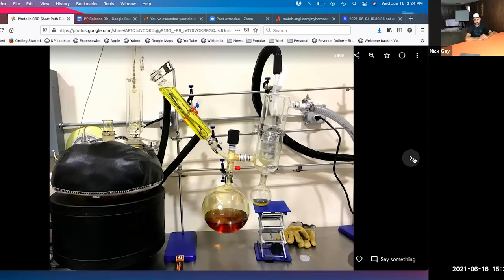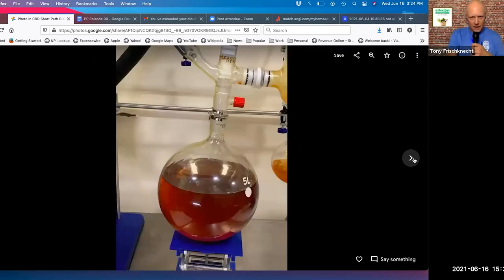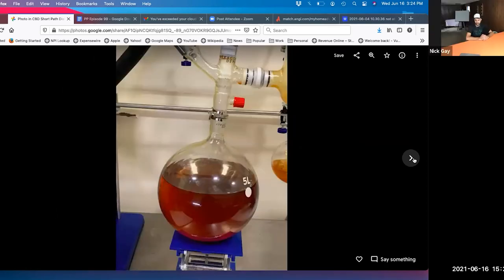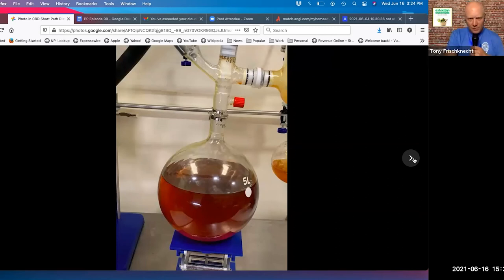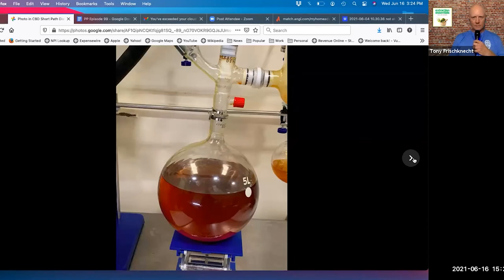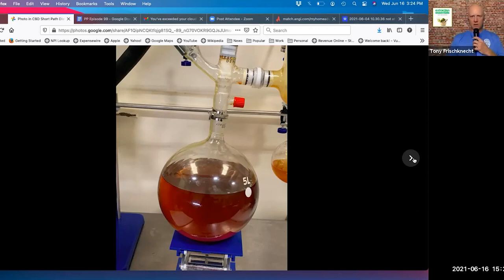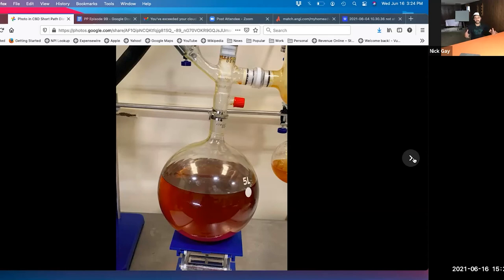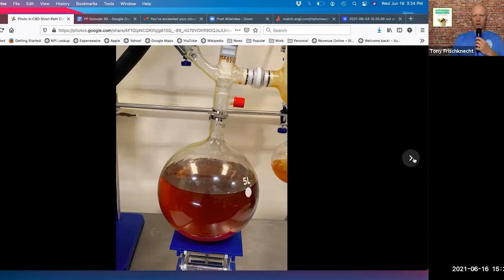My background was growing up as a carpenter. You don't need to sand a two by four that you're building a house with down with nice fine sandpaper if you're going to be hiding it in a wall. It doesn't make any sense. Let's move on. We've got the five liter flask, it's almost all the way full. That's about 4,000 grams of CBD distillate there.